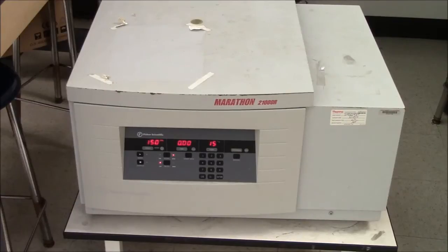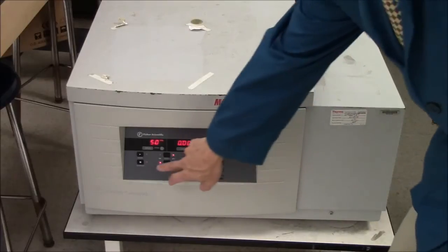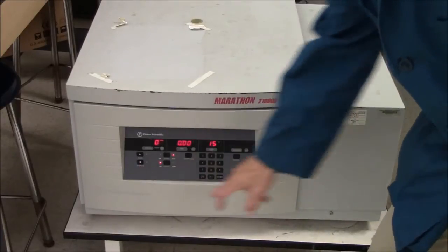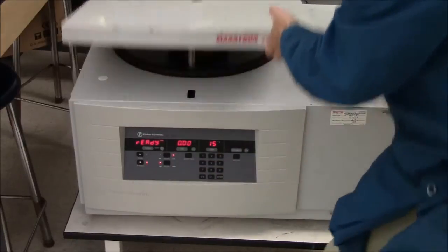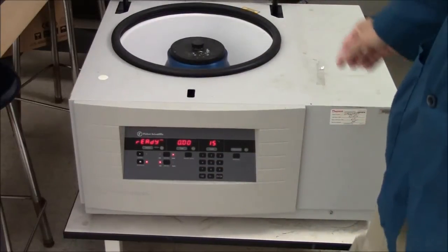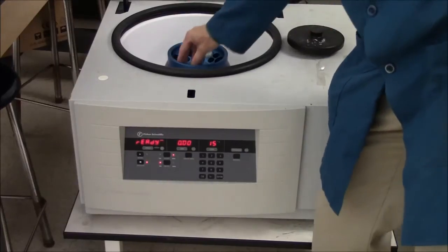Centrifuge has finished its spin. It's slowing down. The beep beep beep says I can open it. I need to press this button here. Hit stop/lid. Press it again while pulling on the lid. I can remove my tubes.